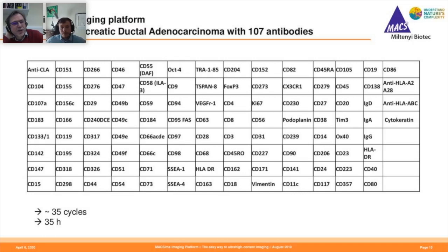And the eraser residue, do you have much problems with those? Residue from previous rounds? So the photo bleaching style, obviously your antibody's still there. You're just destroying the fluorophore. So there will be some stuff left from previous staining rounds. The release one, we're talking about thin samples here because we're only dealing with an epifluorescent microscope, 15 micron maximum, ideally around that or less. So it's relatively easy for the solution to get into the sample, and this releasable solution is just a simple enzyme, so it's quite easy to wash on and off.